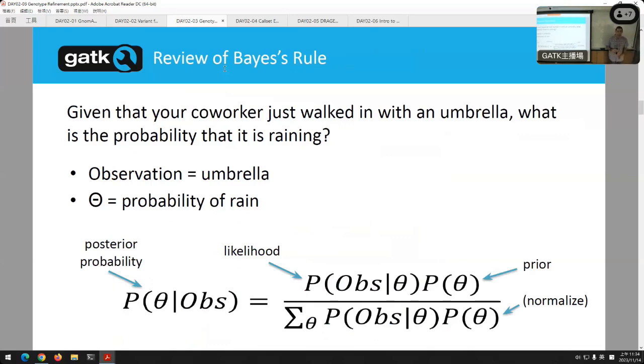Now, the prior probability is how much we know from the chance of that happening based on, again, an African sample, the frequency in the population. So I know this variant happens in 90% of samples of African ancestry, and this sample is of African ancestry. Well, my prior probability is pretty high that this is a real variant, right?